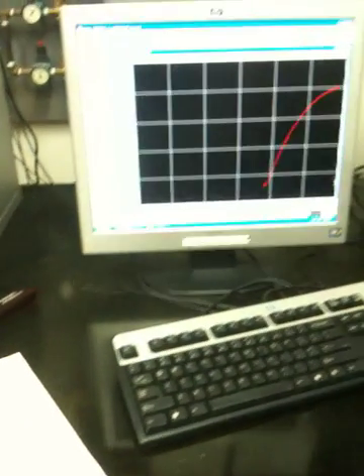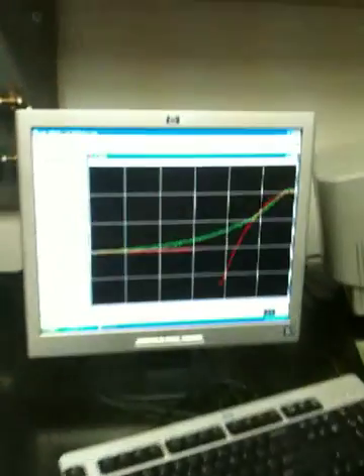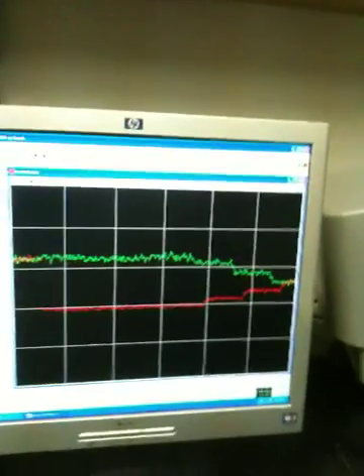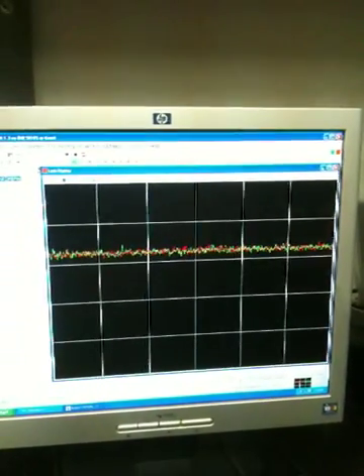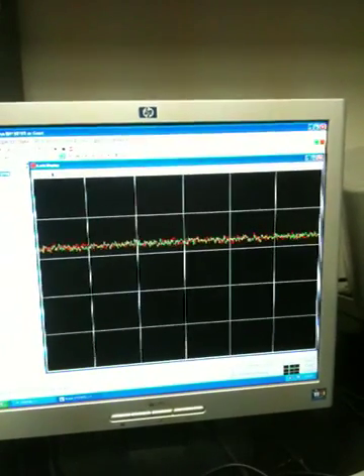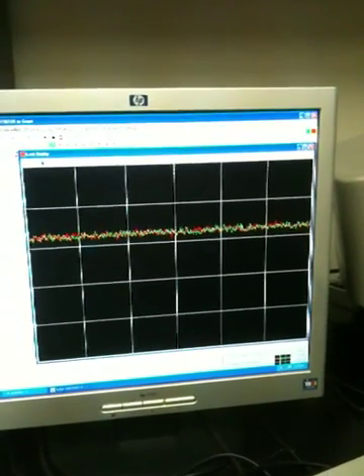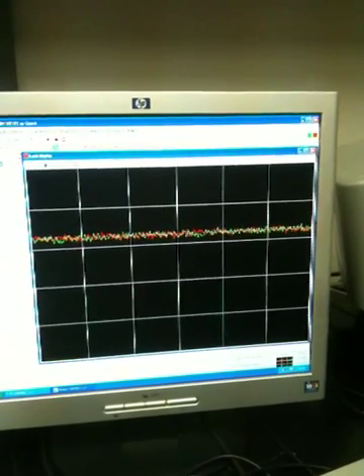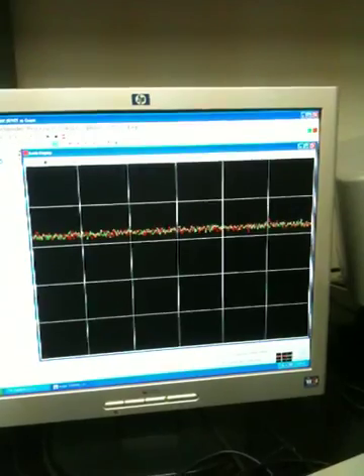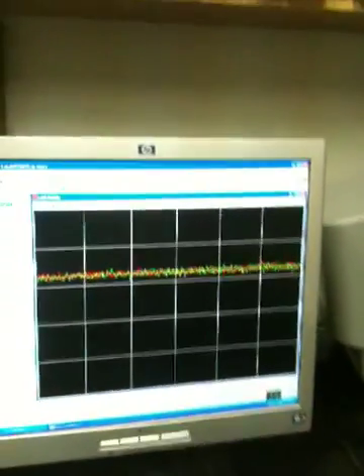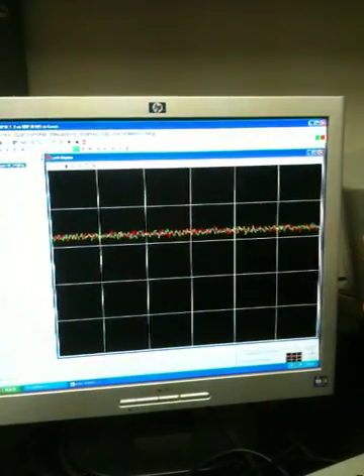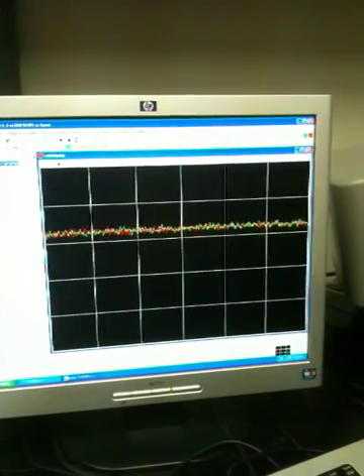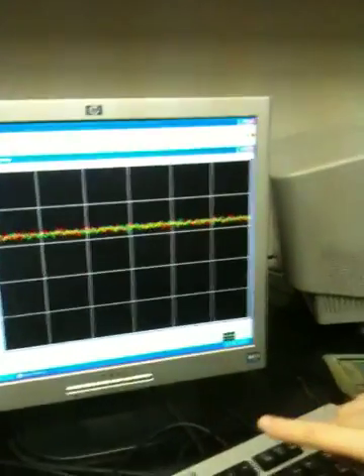And you'll see this crazy signal rolling all over the screen. This is the deuterium signal from the sample. This is actually an NMR of the deuterium in the deuterated chloroform. This is not a spectrum of your sample. This is what I call a dummy signal. You know, the physicists very intelligently worked out a way for the chemists to evaluate the deuterium signal by the height of this line and the thickness of that line.